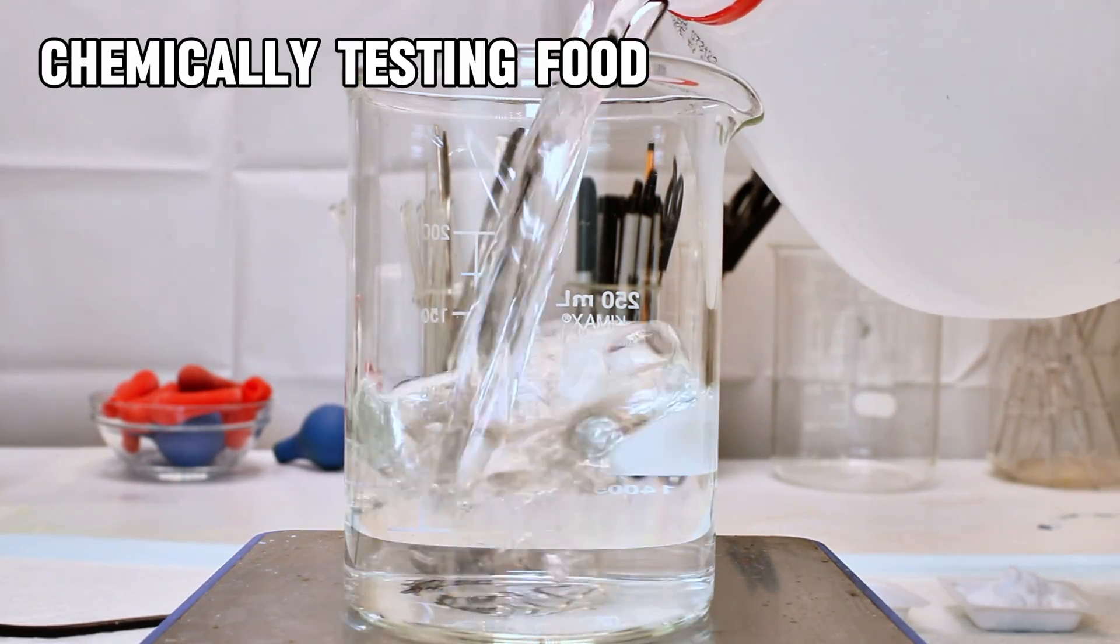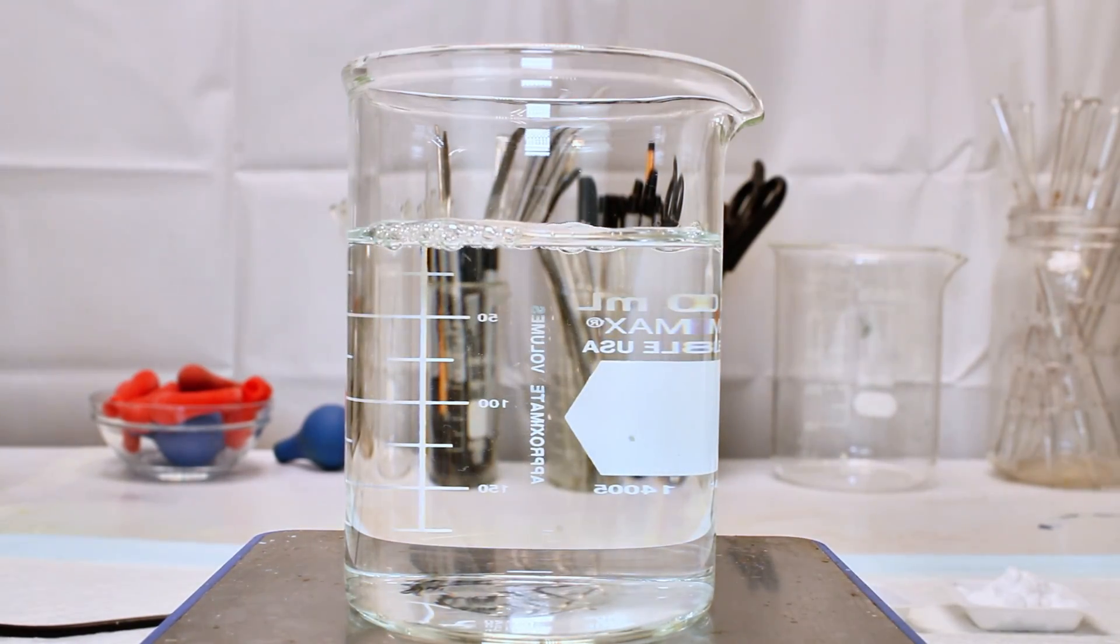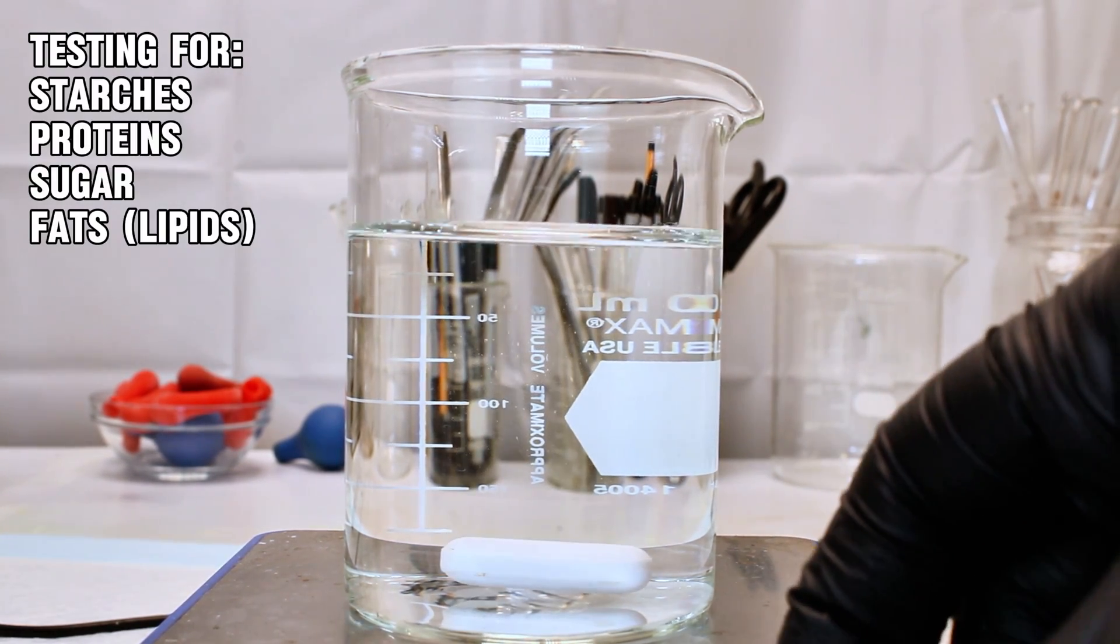Today I'm going to demonstrate a few ways scientists can test for the presence of different types of molecules in food, specifically starches, proteins, sugars, and lipids.